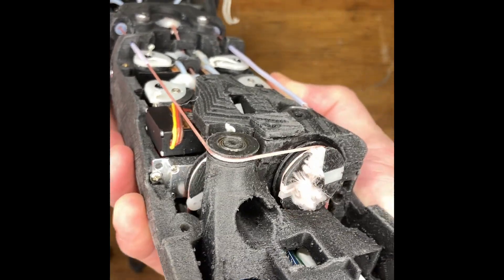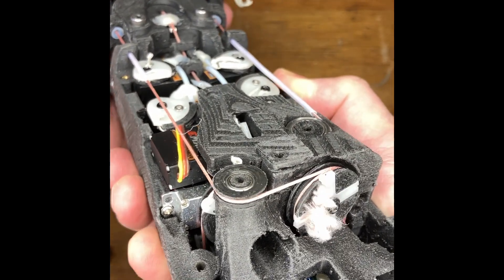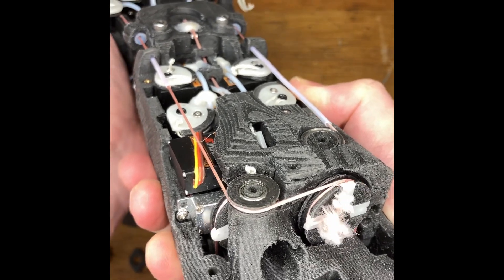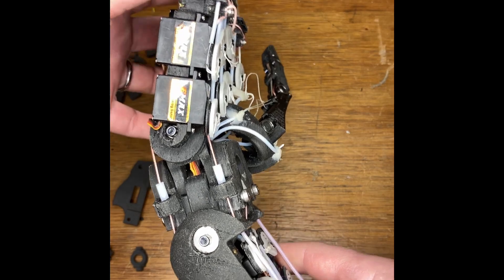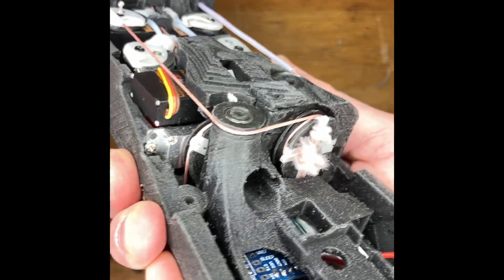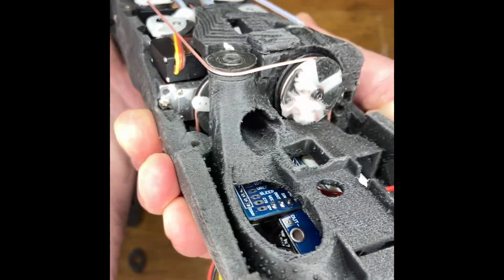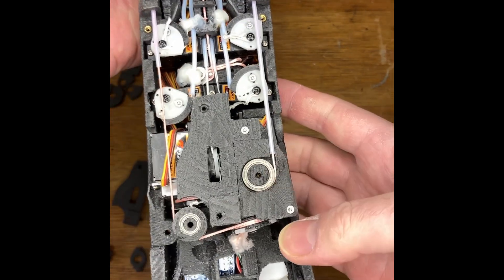There are two wrist motors and they link the diagonal corners of the wrist, so by driving them differentially or together you can produce all the rotations of the wrist. When I first made it I wasn't 100% convinced it would work — it just seemed too neat. But it's a lovely little mechanism. It needs to have a little bit of preload when you put it together, and it works with various kinds of bearings.